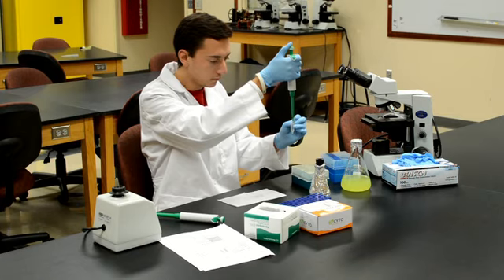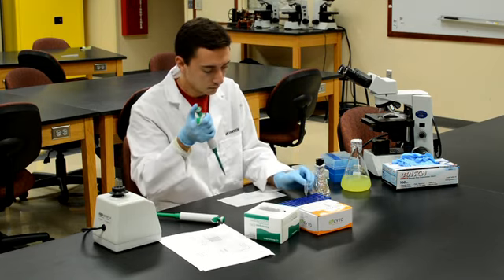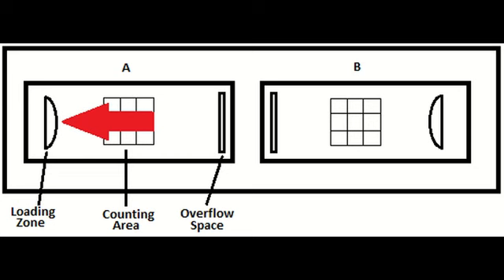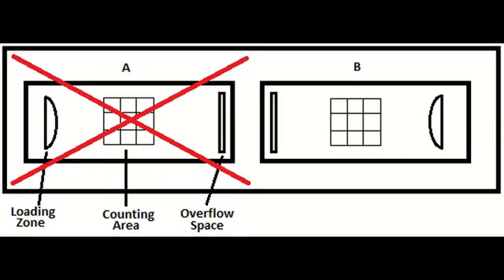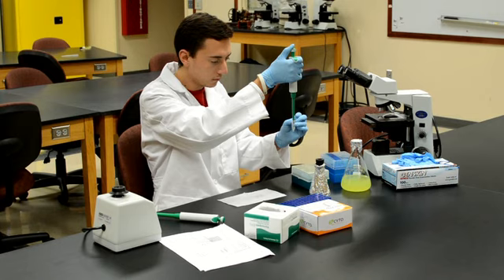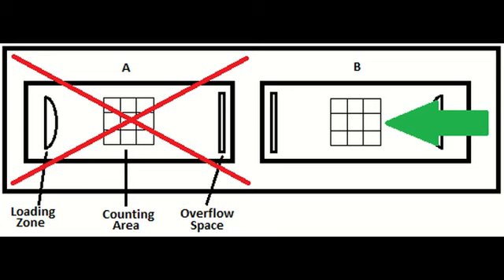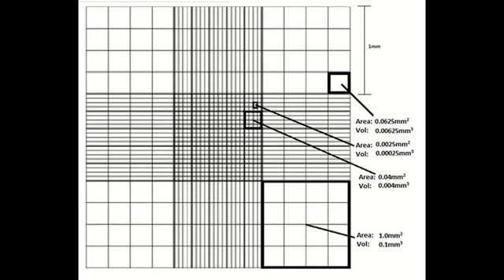Using the smaller pipettor with a fresh tip extract 10 microliters of your stained and mixed sample from the microcentrifuge tube. Pipette this volume into the hemocytometer's loading zone. Capillary action should take the sample into the counting chamber immediately. If it fails to take up the sample, or if you see dry spots, your counting chamber may be dirty. If this is the case, simply extract another 10 microliters and use the other counting chamber. Now that your sample is loaded, you can begin counting.